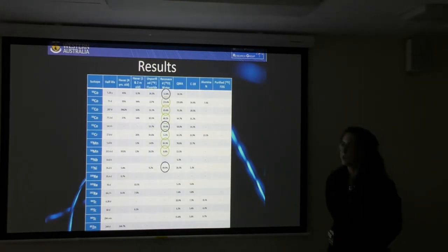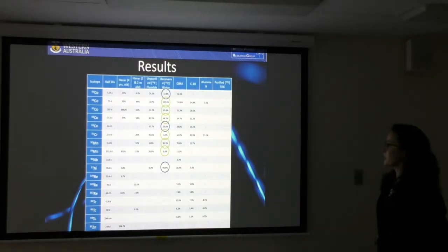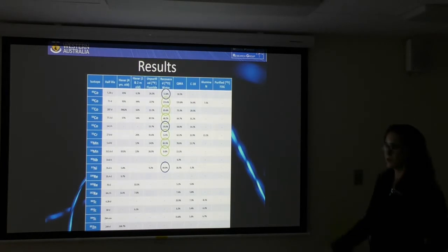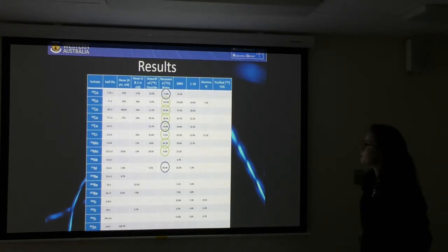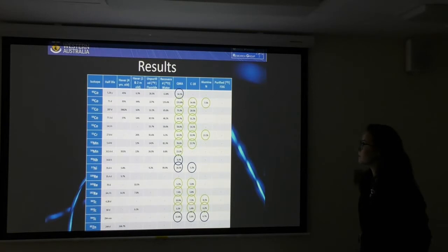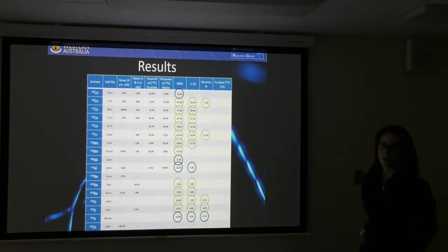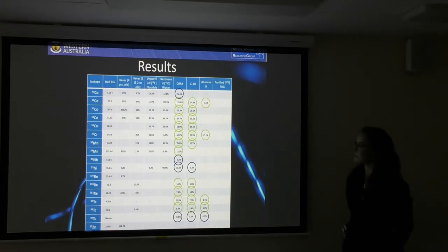Next, we can see in the recovered water. Again, as I explained before, the majority of the isotopes do get stuck on the QMA column, and just a few are eluted through into the recovered water. And then next, these are the isotopes that I found on the columns, and as you can see, they're slowly incrementally removed as we get to the alumina, and then thankfully have not found anything in the purified F18 FDG.